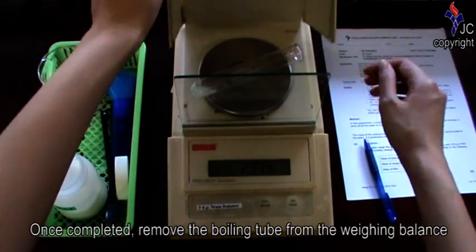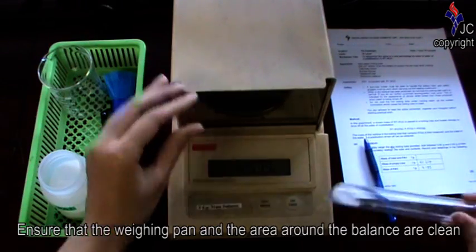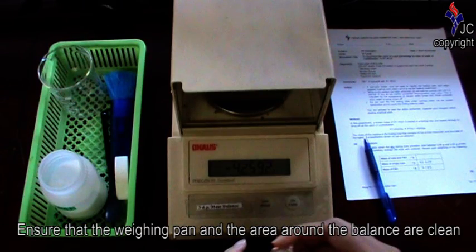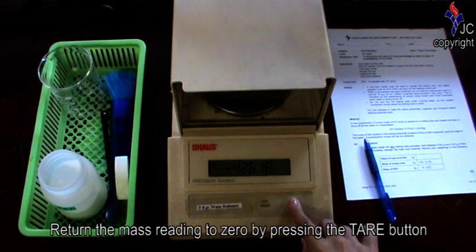Once completed, remove the boiling tube from the weighing balance. Ensure that the weighing pan and the area around the balance are clean. Return the mass reading to zero by pressing the tare button.